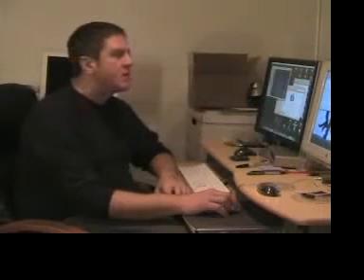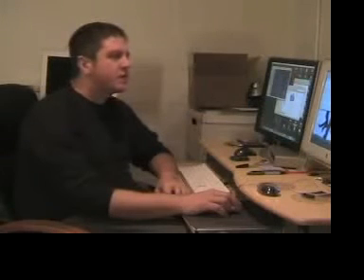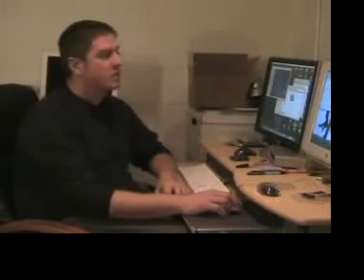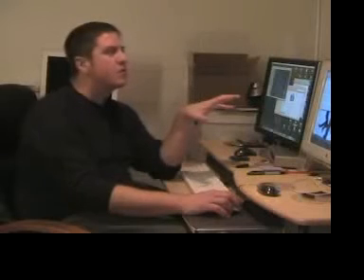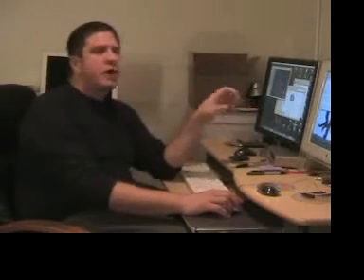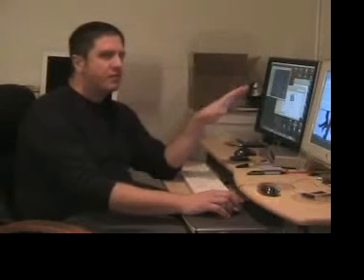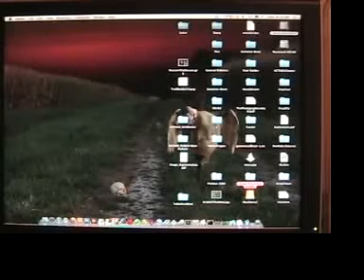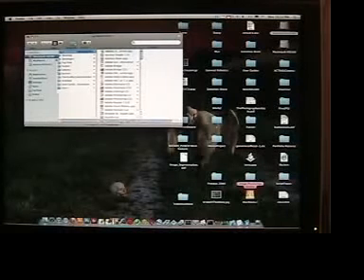Hi, I'm Jason. This is the method used to quantify the foliage surface area in photographs of flora samples. The setup is going to require you to have a Macintosh G5 computer running OS X 10.5 Leopard. It should have AppleScript on it. This should be a part of the Leopard setup, but it is possible to remove it. To make sure it's there, look under your applications for the AppleScript folder, and it should be in there.